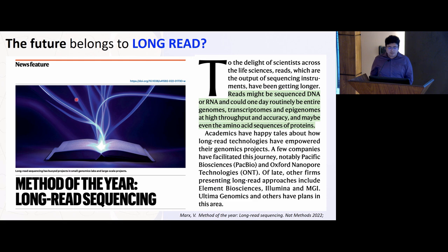So this is my last slide. Long read sequencing holds a lot of promise. I hope I have managed to convey that to you. This was Nature Method of the Year in 2022, and the editor wished that maybe someday we'll have reads sequenced at DNA and RNA level, with complete genomics, transcriptomics, and epigenomics at high throughput and accuracy. So with that, I end my talk.